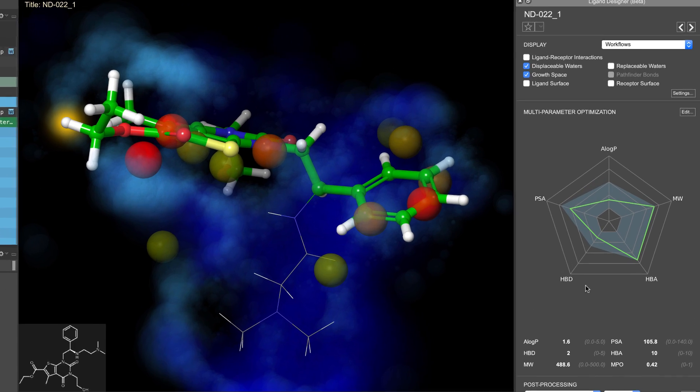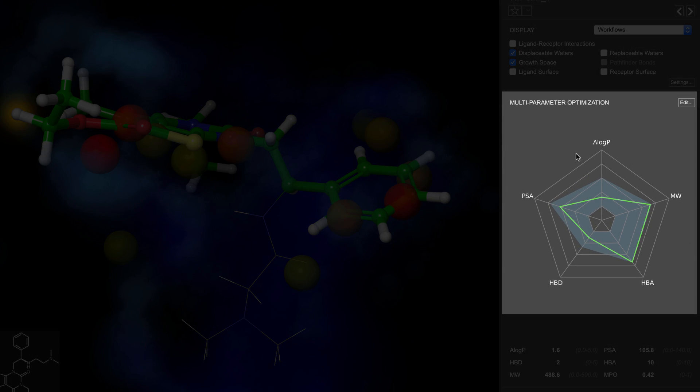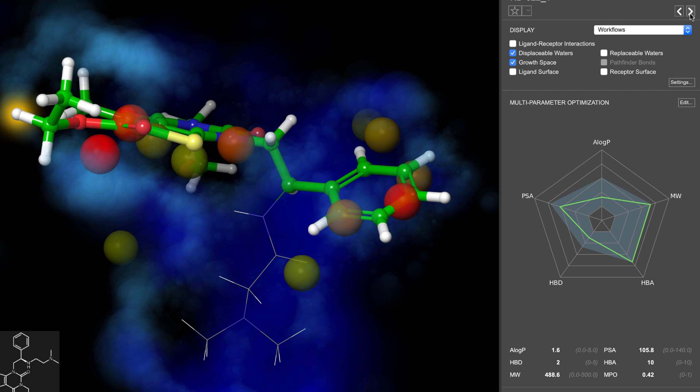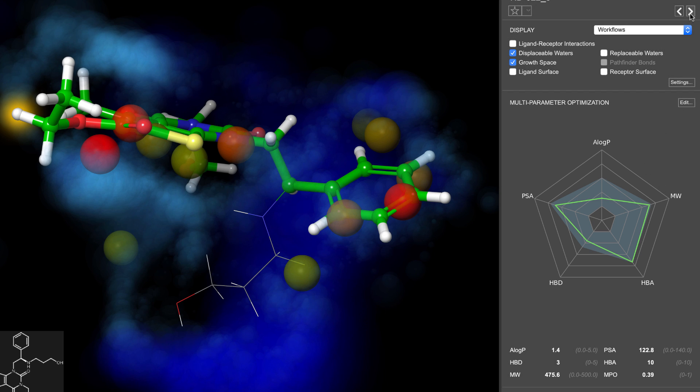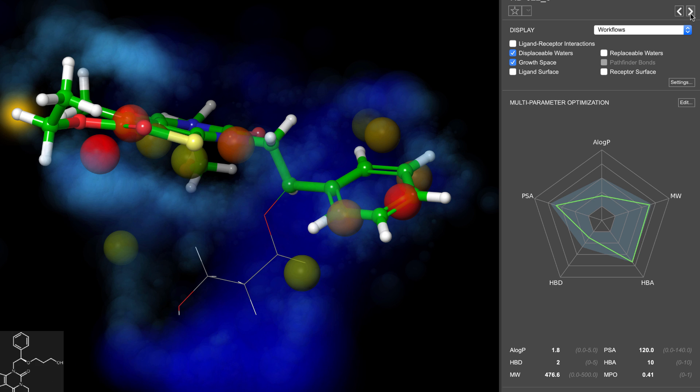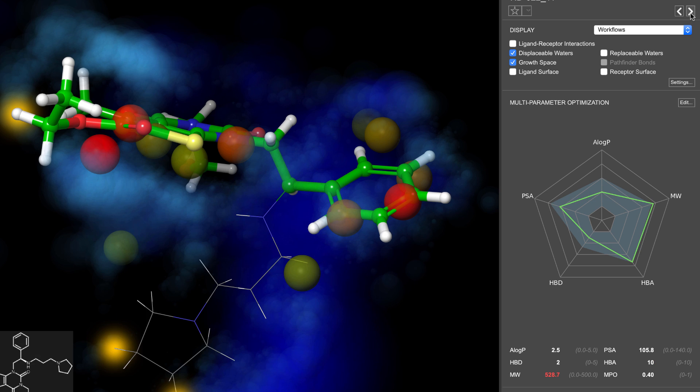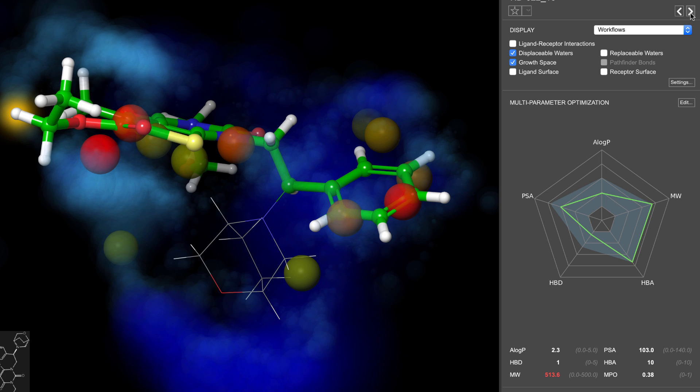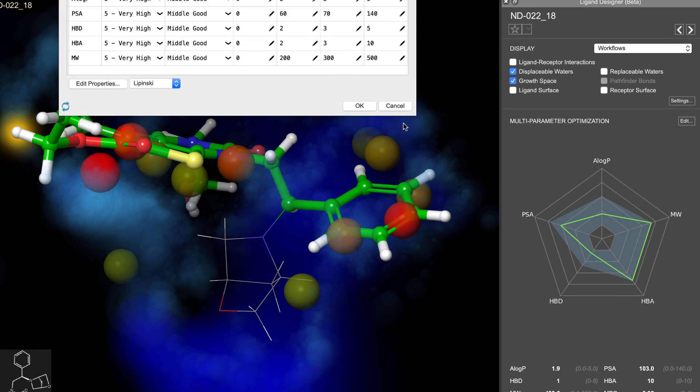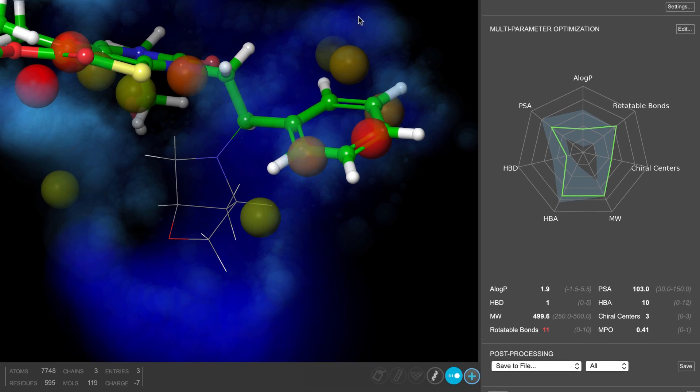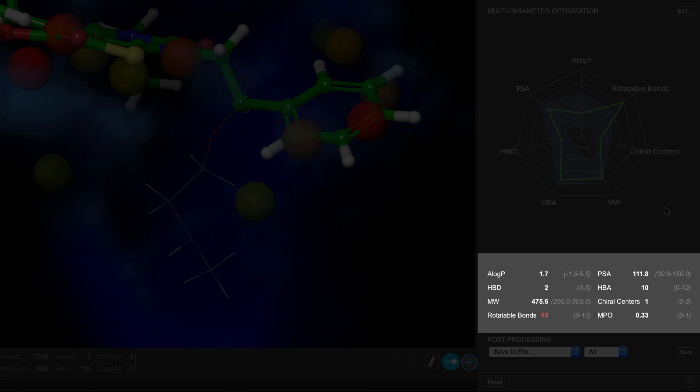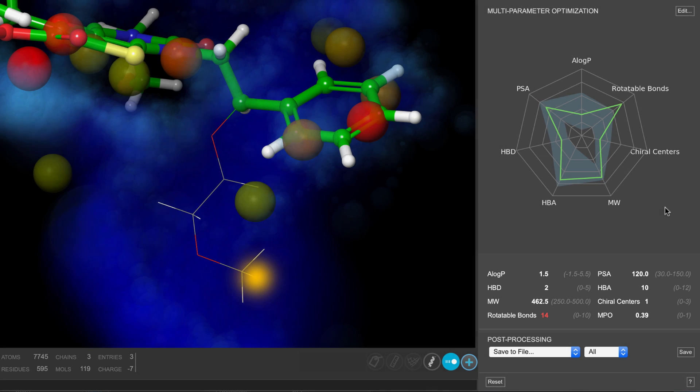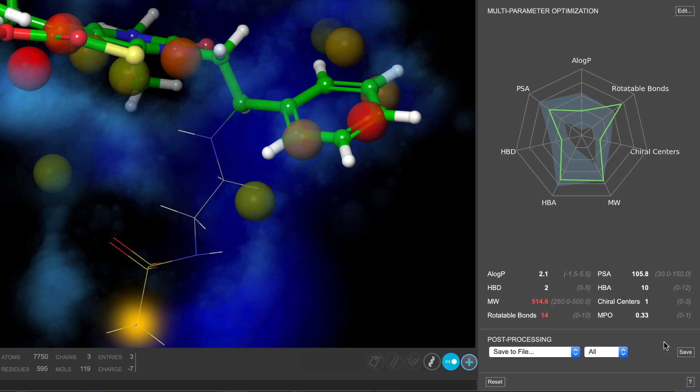Now, at the center of the panel we see the multi-parameter optimization section where one can examine graphically the values of multiple properties and determine whether new ligands meet the defined acceptance criteria as shaded in green. Here we see the standard Lipinski's Rule of 5, but this can be edited or switched to other presets. Below, we see the property values which update in real time from ligand changes. The MPO score is also displayed here.